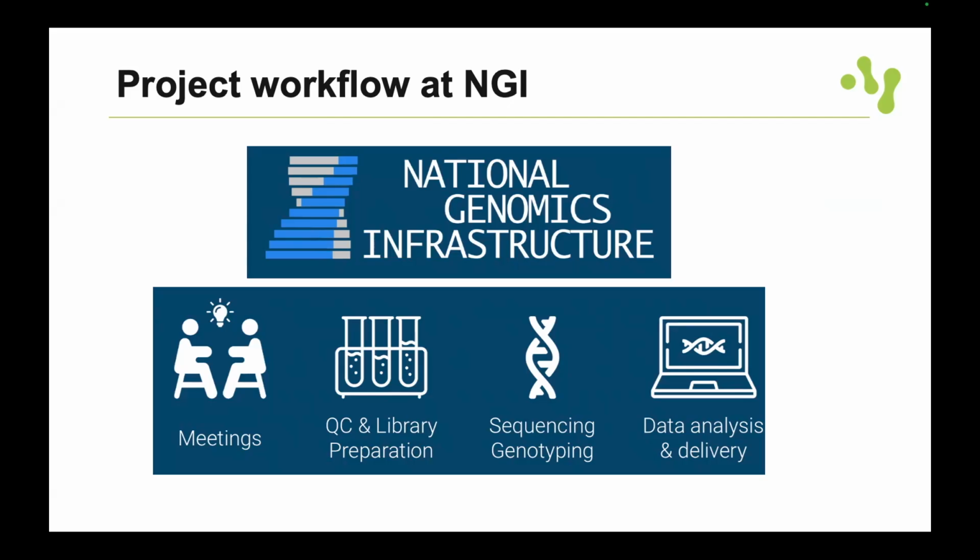So reach out to the coordinators, they will guide you. And also we do the sequencing, and for the single cell methods, in most cases, if it's a common genome, we will do the mapping, like run Cell Ranger or the equivalent.